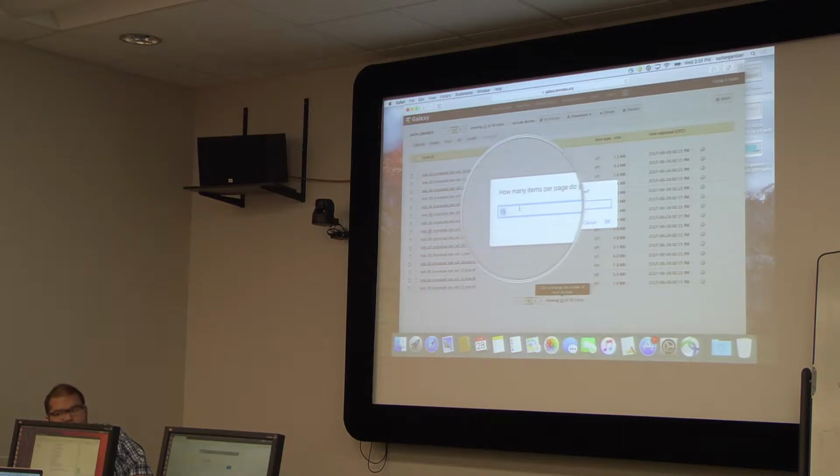We identify the large object. So is it like metadata or something? No. It's just regular image processing. We have algorithms for identifying the largest object. We do have some manual segmentation. Yeah, we do a couple of things to the image. We clean out, they do active 3D contour segmentation to get the object. So we have our own pipeline that we know works on our images. That's the whole point. And then this is what we are confident are the objects for us.